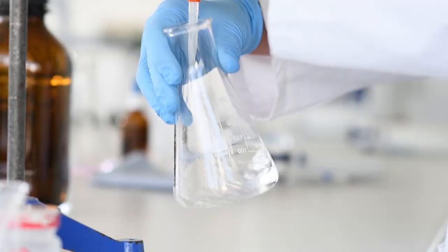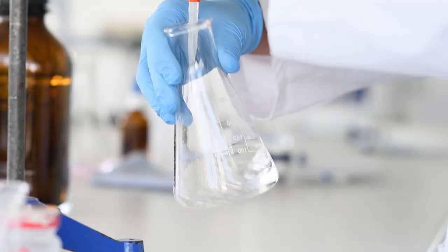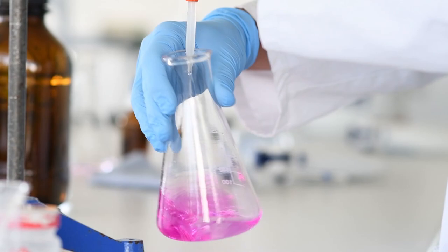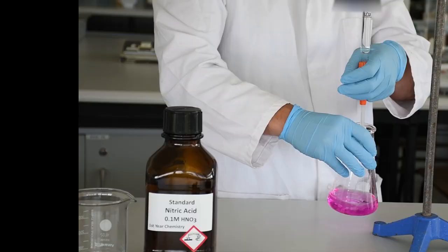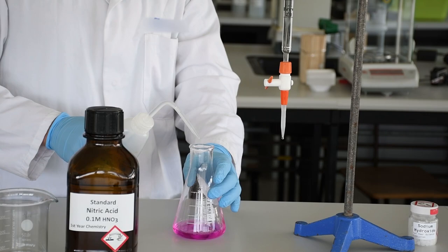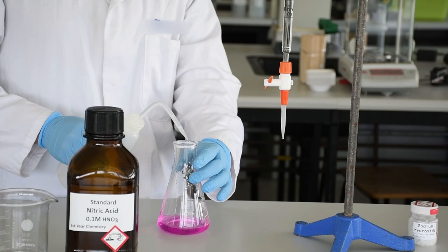We've reached our endpoint. One more drop maybe is going to get us there, and we get a solid pink color that doesn't go away. We leave it to stand for a few seconds, and once we're sure, we wash down the edges with a little bit of distilled water. If the pink color does disappear, you'll have to add one more drop from your burette. At this point, we've added enough sodium hydroxide from our burette to react with all of the nitric acid that was in the 25 mil we transferred with our pipette.